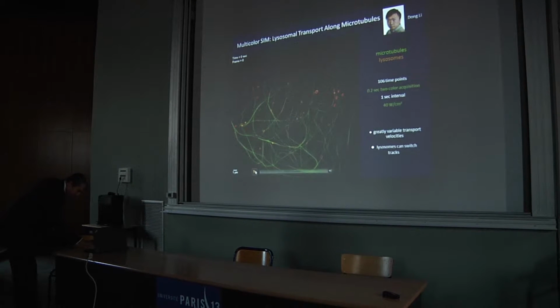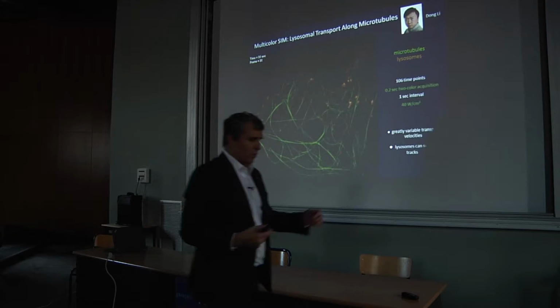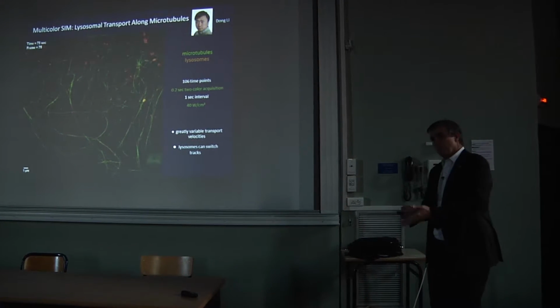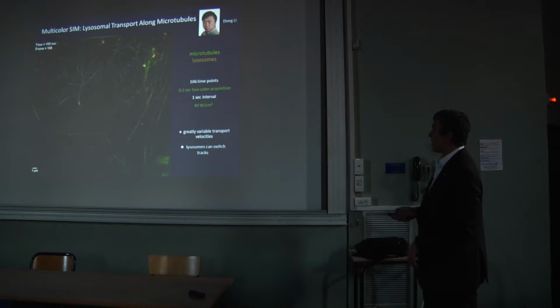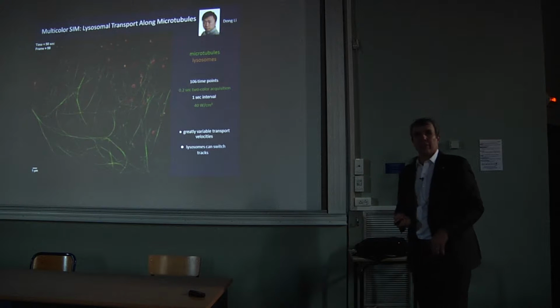Another thing you can do is run these SIM microscopes in not a total internal reflection configuration, but close to it. So you can look at thicker specimens and still not illuminate the depth of the specimen, so you have high enough SNR. It's probably a little hard to see on this screen, but the green represents the microtubules inside of the cell. These little bags are lysosomes.